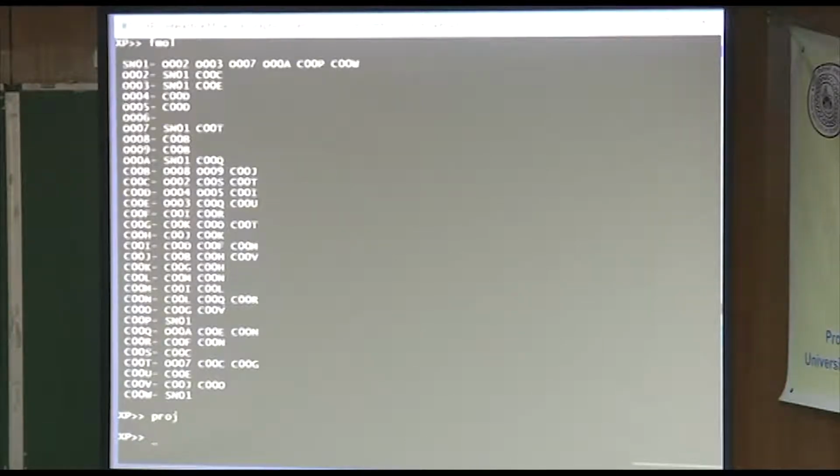I'm just going to have to tell you then. What I see here is another command that's useful is mpln, which calculates the least squares plane of everything in the structure. And then when you say proj, you're looking down the normal to that plane, and it helps to spread everything out. So if I proj again, you see how more spread out it is?